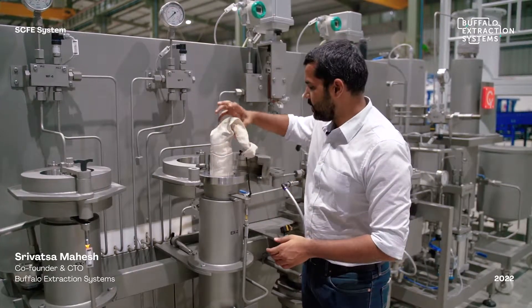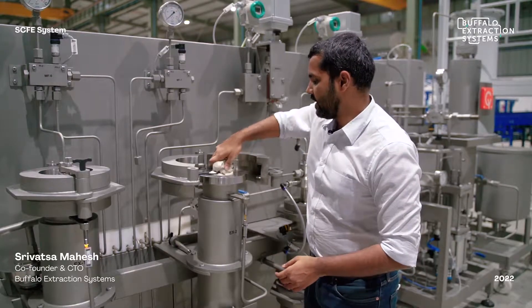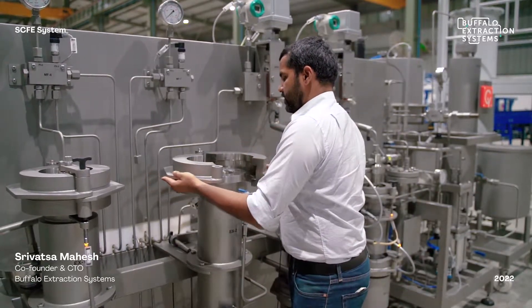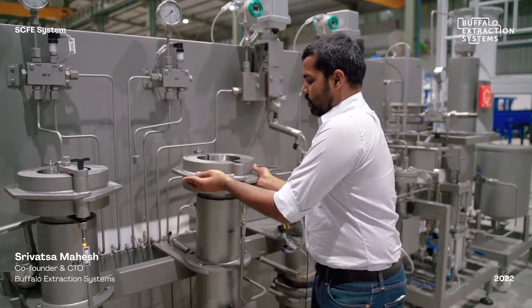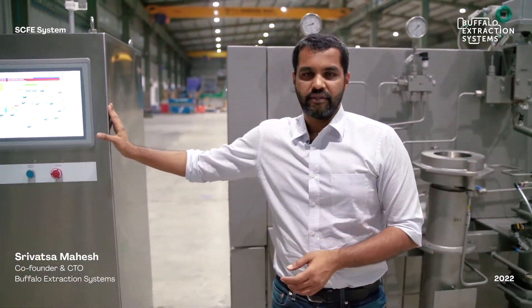The biomass is loaded in here, and then the system is completely automatic beyond this point. Once you load your biomass and close the extractor, the entire process is controlled through the HMI system or the SCADA system that we provide.